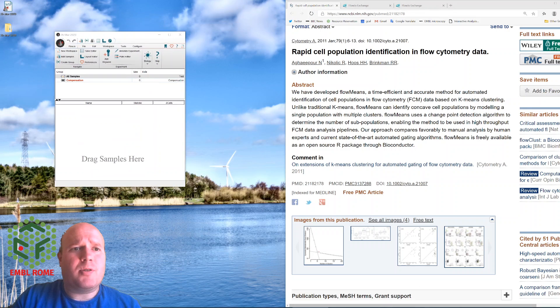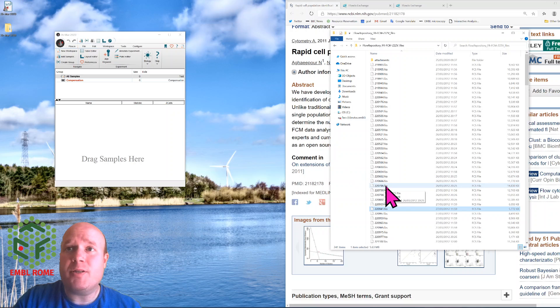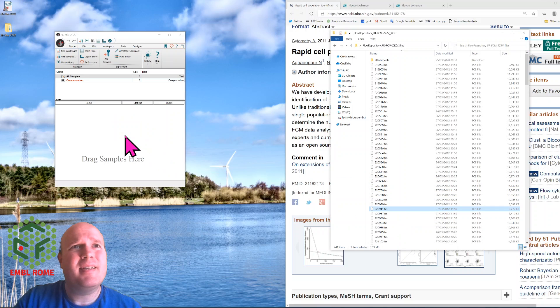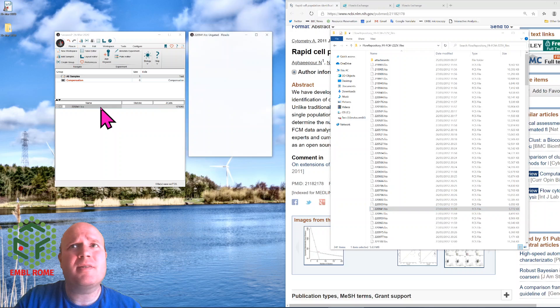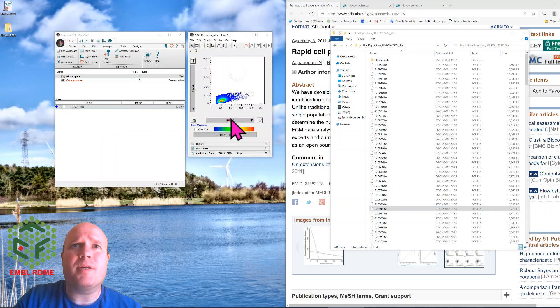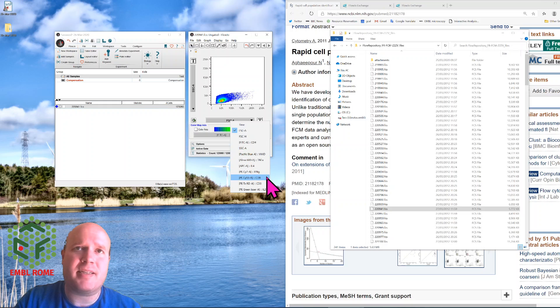So I will load some data, so this is from FlowCap, this is Flow repository, this is FlowCap2 data, these are HIV samples, and we have, if we look at the data, it's CD4, CD8 cells and different cytokine receptors.